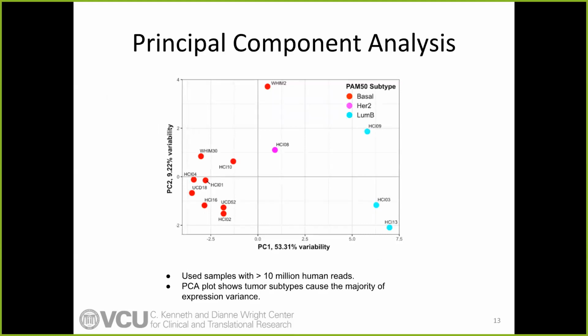And then we took the 50 genes that it used to do the classification and took their gene expression profiles for one PDX representative sample. Each of these have about 3 to 6 biological replicates. We just picked one. And we did a principal component analysis just to see where the main variability was.